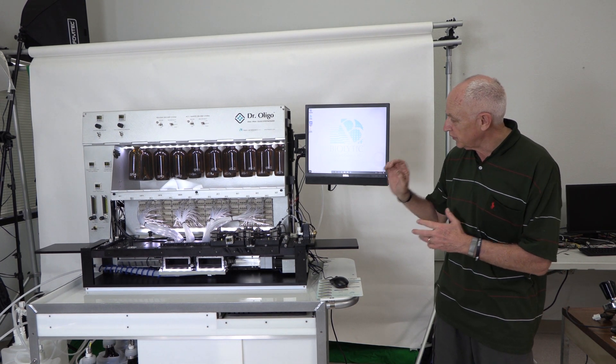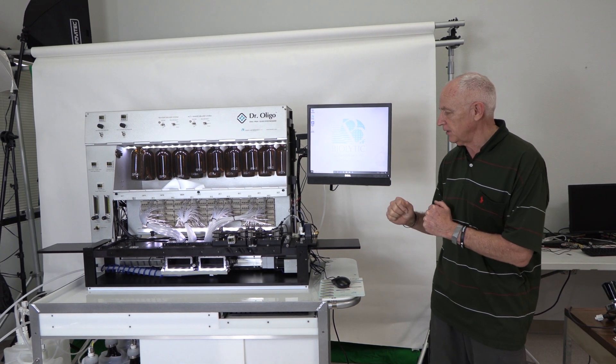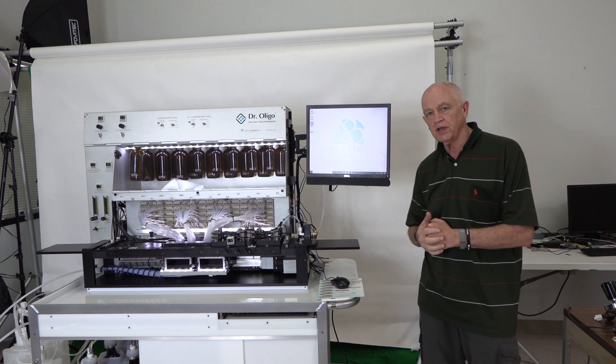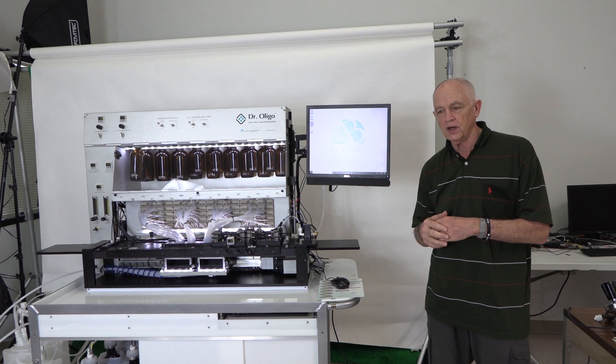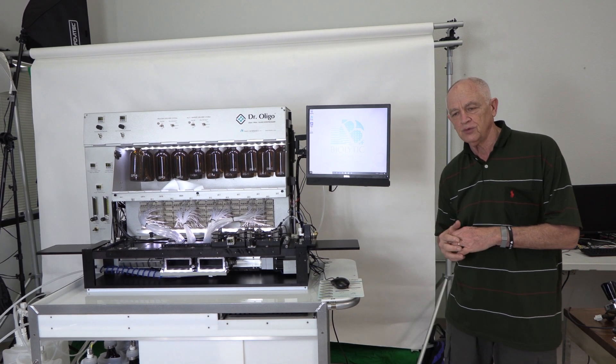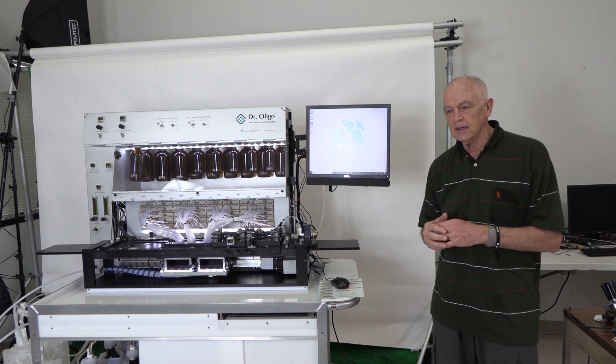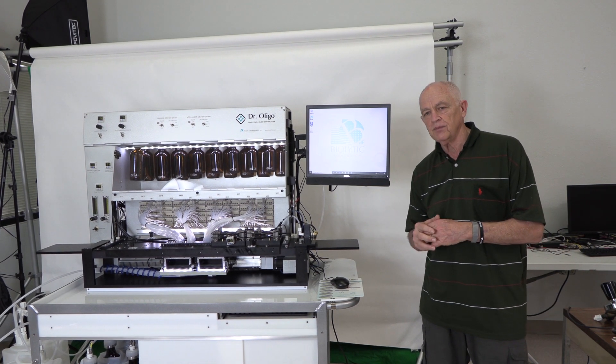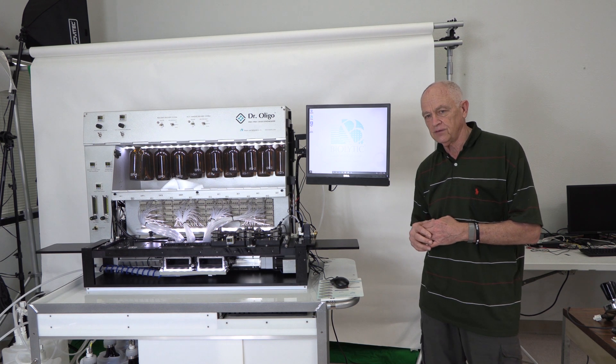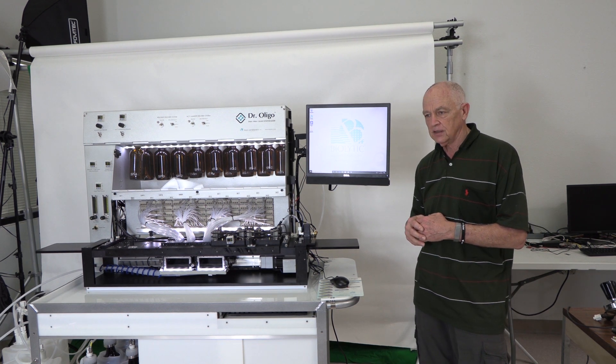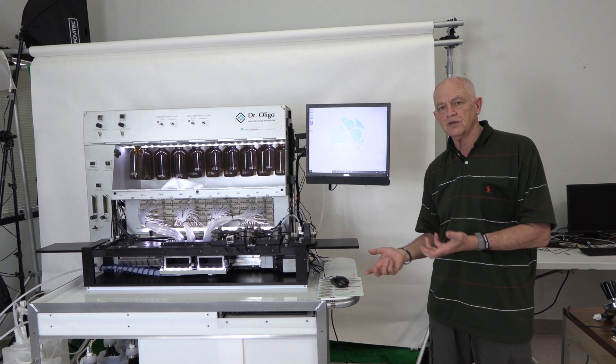So this can synthesize in one or two plates. It can synthesize anywhere from one oligo up to the maximum that the particular model is that one has purchased.